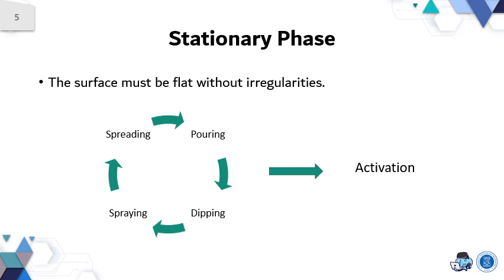Modern methods utilize a spreading device for the preparation of uniform thin layers on glass plates. There are two types of commercial spreaders: moving spreaders and the moving plate type. This spreading will give a layer thickness from 0.2 to 2 millimeters.